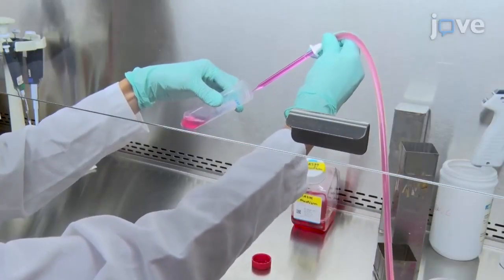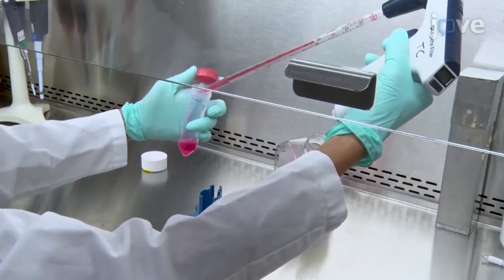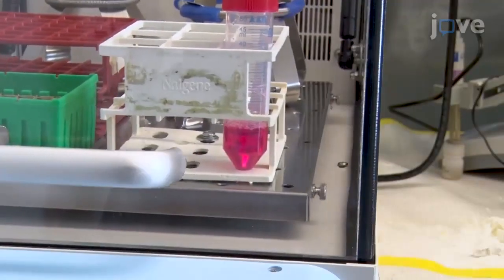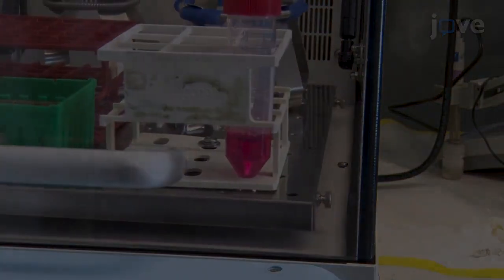Discard the supernatant and resuspend the pellets in 10 ml of wash medium with collagenase and DNase. Allow the minced tumors to digest at 37 degrees Celsius with slow shaking for 90 minutes.